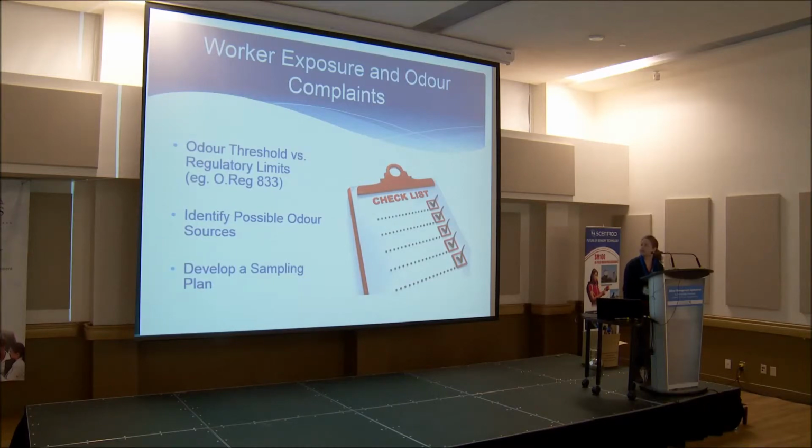My next example is going to look at worker exposure and odor complaints. A lot of the time in work environments, people are working with various products, and really the only time you hear a complaint about working conditions is when there's some sort of odor present, and it may or may not be obvious where it's coming from.